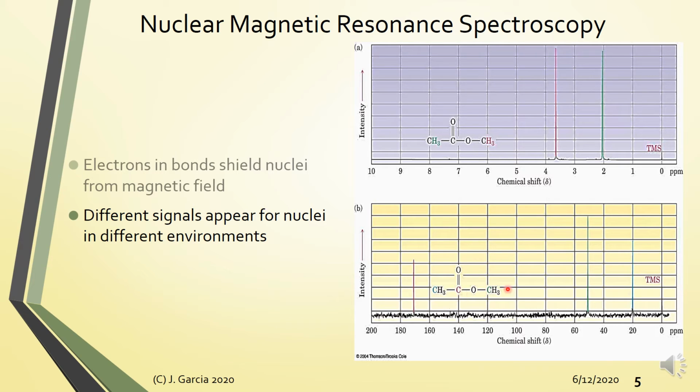This methyl here is around 55 ppm, again because it's attached to an electronegative oxygen, whereas this one, since lesser yung electronegativity ng carbonyl group to influence the electrons in this particular bond, it's located at a more upfield location in the NMR spectra.